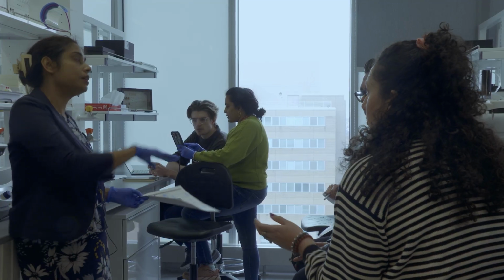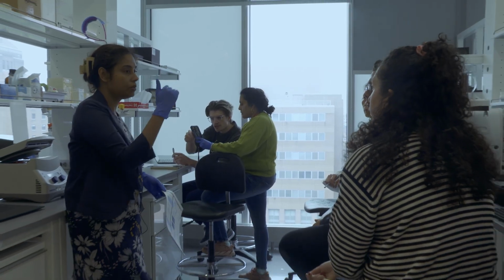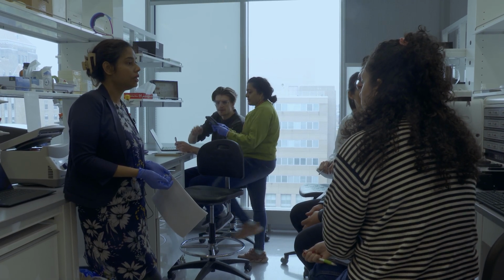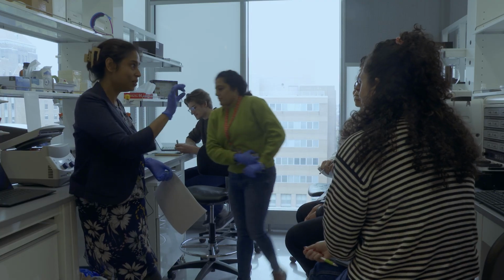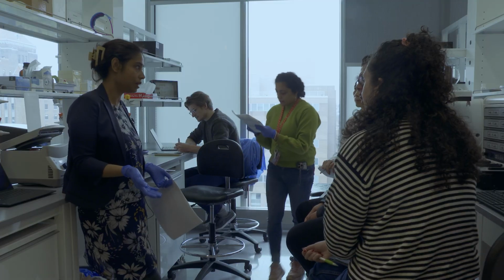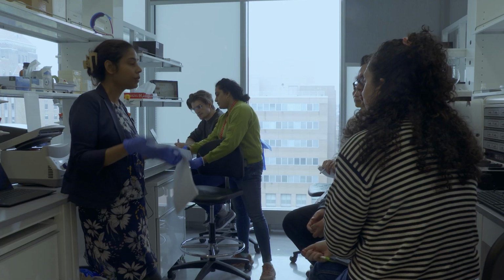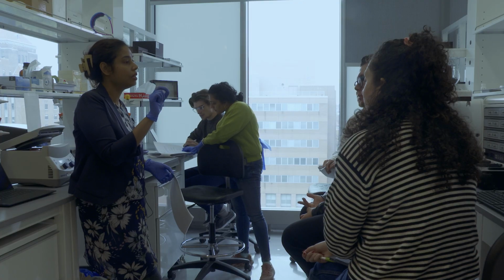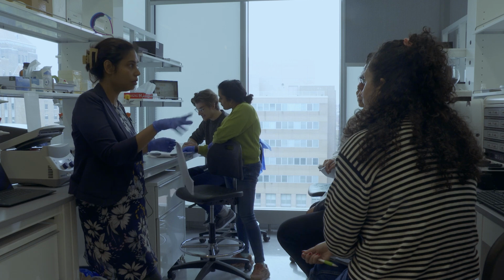So when we run any nucleotide sample, DNA or RNA, in a gel, we are able to see different bands based on different molecular weights. The state of the art method was to cut the gel. Let's say I want 170 nucleotides and I have a 1,000 nucleotide contaminant there. Then we can run it in a gel, cut out the 170 nucleotides, and then do the purification of that particular DNA.